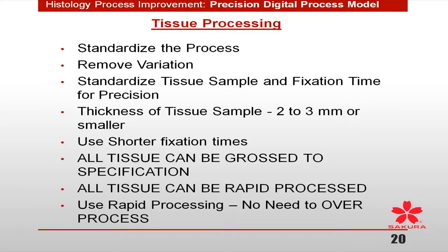You need to go out there and investigate what's available to you to either help you change, help you improve, help you create a better quality sample result, and you need to look at all of these with maybe some new eyes. There's value to having a process that has worked for you for several months, years. There's also value in looking at that process and asking, is there something we can do differently? So again, standardizing the process. Look at the instrument that you're considering, look at the instrument you're using, and how can I move to a more precision process.